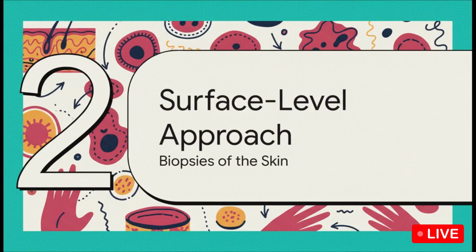Okay, let's switch gears. We're moving from those deep tissues right up to the surface. We're talking skin. These biopsies are all about figuring out what's going on with rashes, moles, and other things you can actually see and touch.